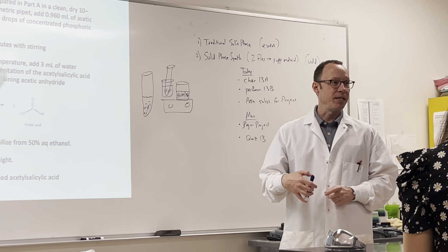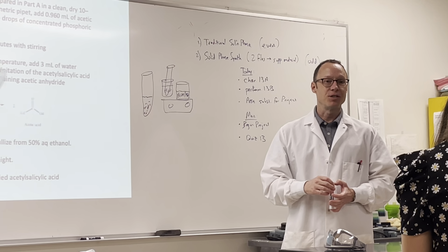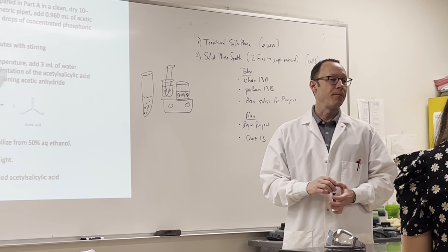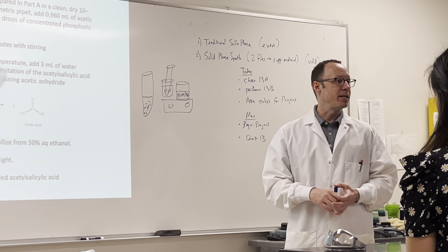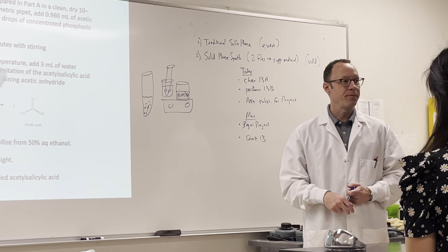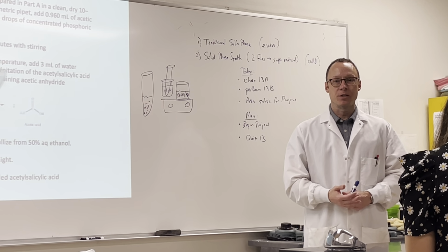I would not recommend characterizing your crystallized aspirin today, because it's still going to be very wet coming out of the ethanol water, which is fine. You'll have plenty of time on Monday. You can just start with the characterization of the aspirin then. Okay? Any questions on the procedure or what we're doing today?